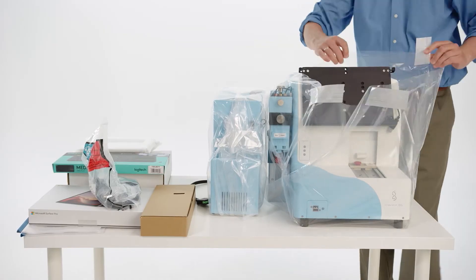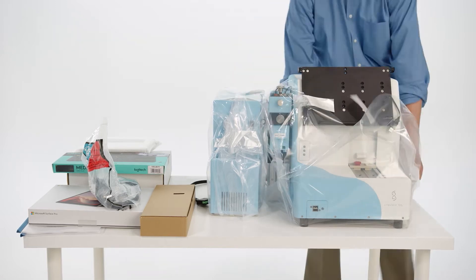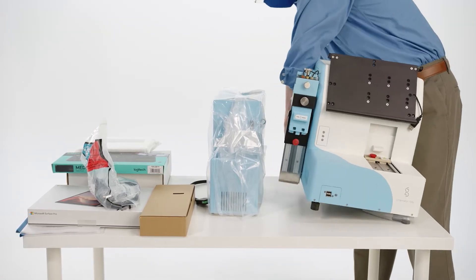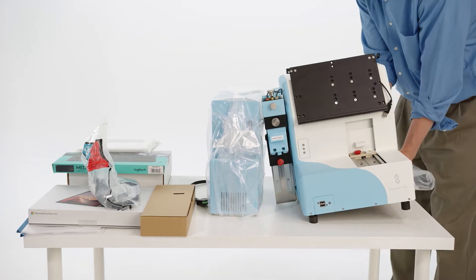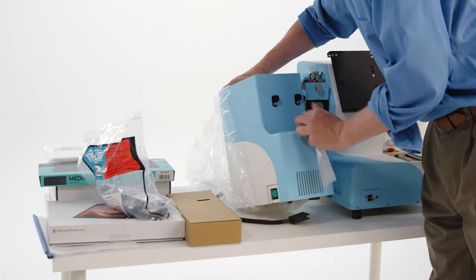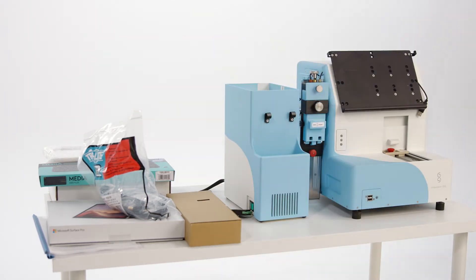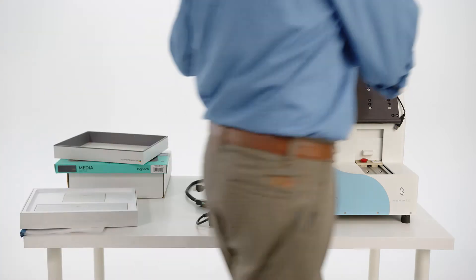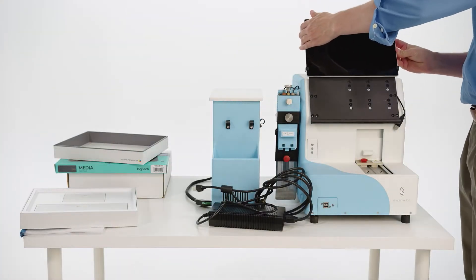Carefully remove the protective plastic cover from the Singulator, then carefully remove the protective plastic cover from the chiller unit. Remove the tablet computer from its box and slide into the tablet holder on the front of the Singulator from above.